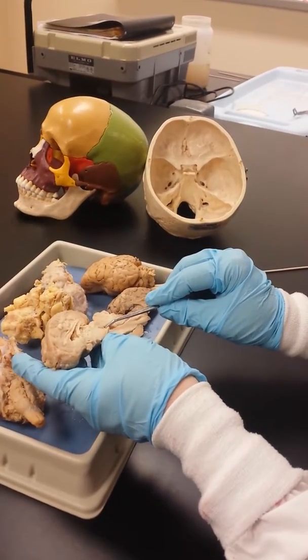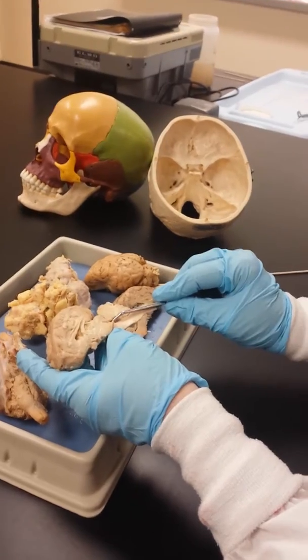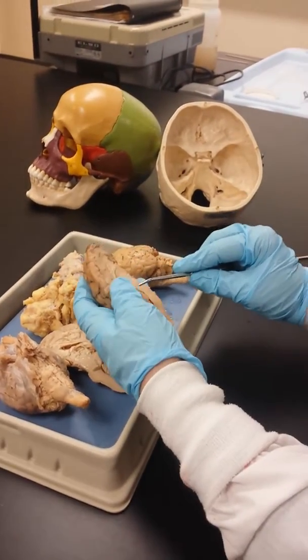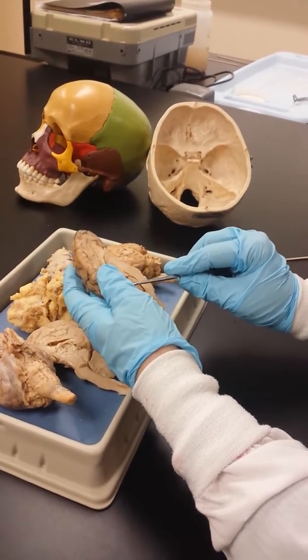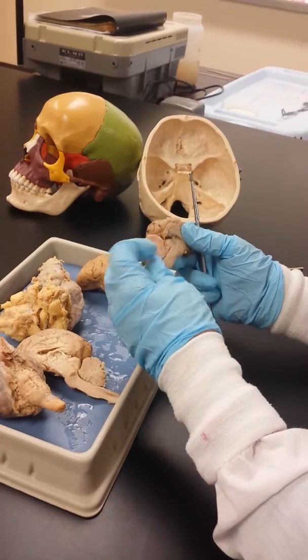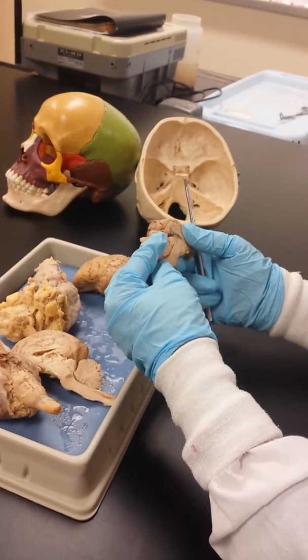You can see the tissue on one side. See that tissue? If it wasn't cut, and I put, you can see it here again. See it right there? You can see it really well right there. Can you see that tissue? So it makes a space in there. That tissue would make a space.